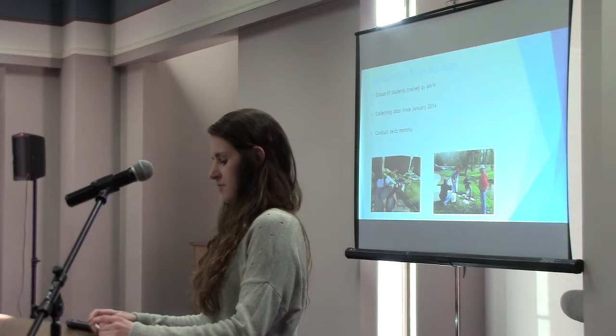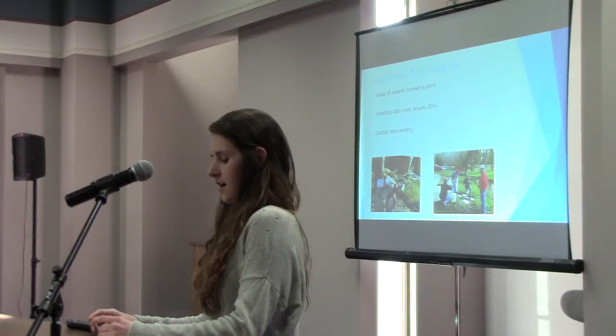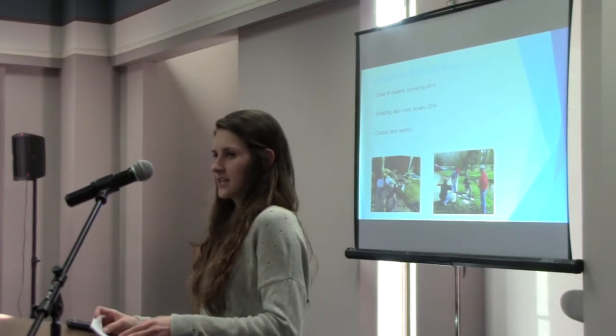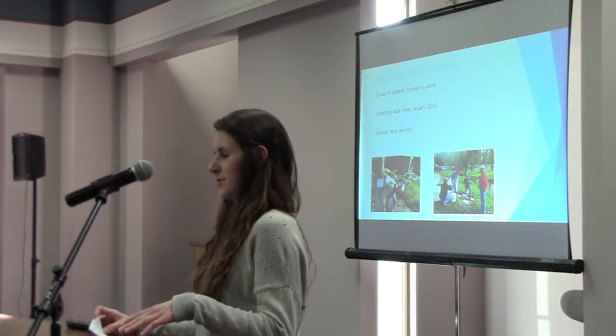We've collected data monthly since January of 2014. The monthly testing is required to keep good track of the water quality because it can change daily, so they prefer that you test it at least once a month, preferably around the same time each month.